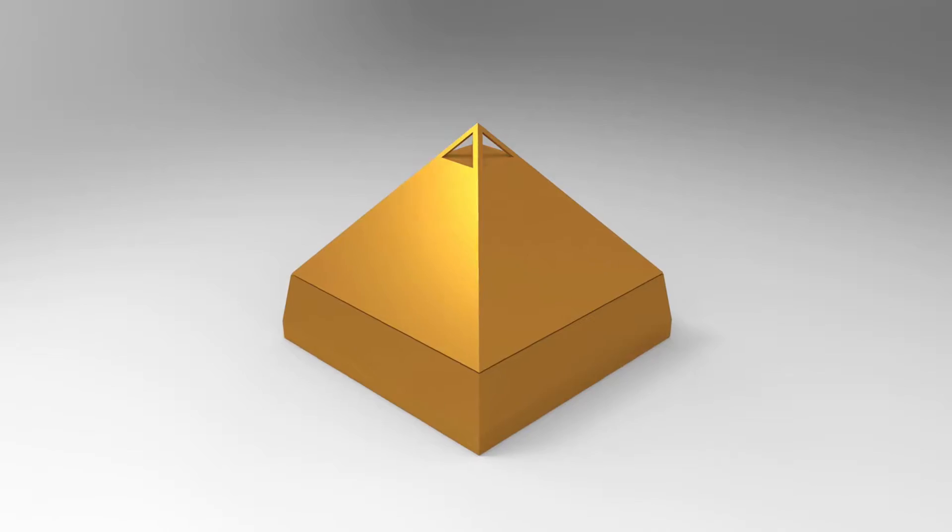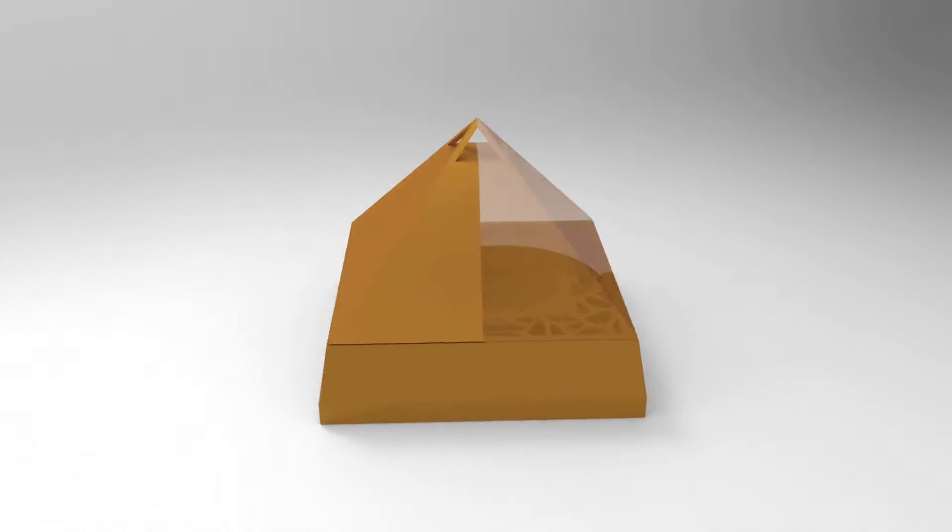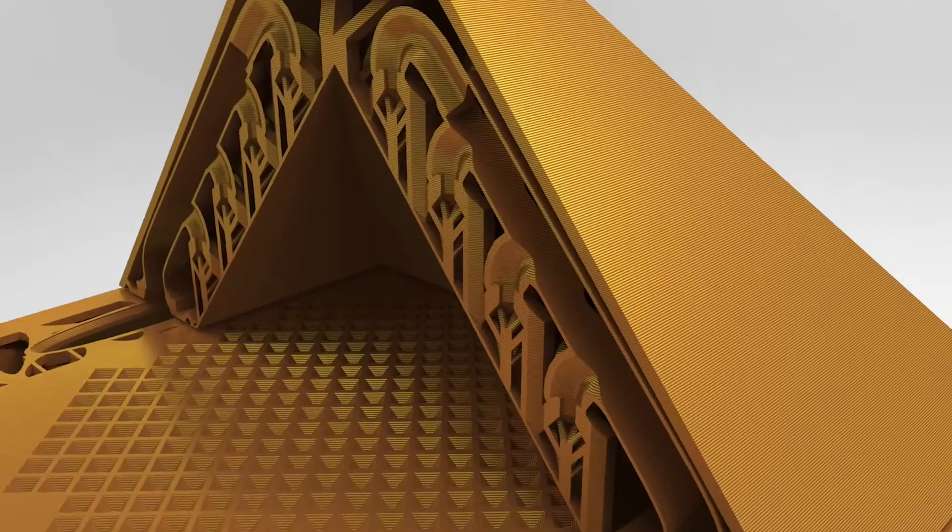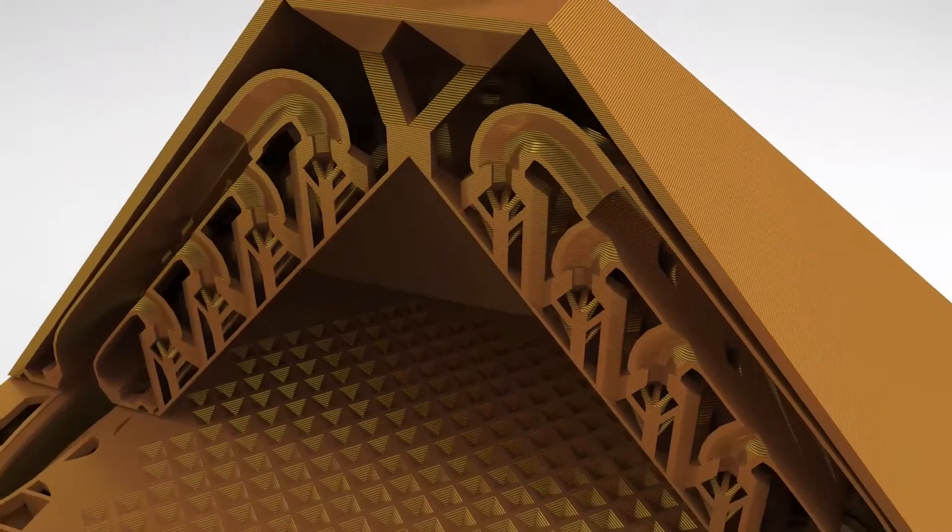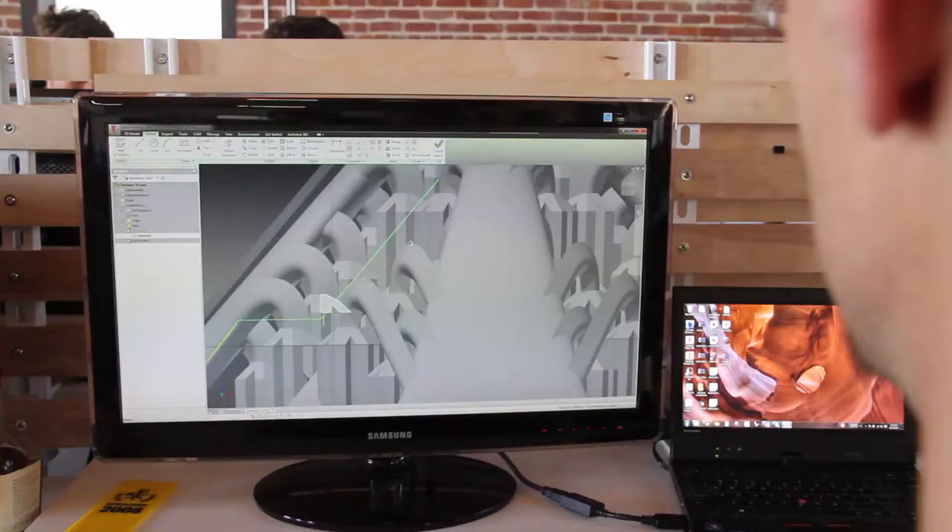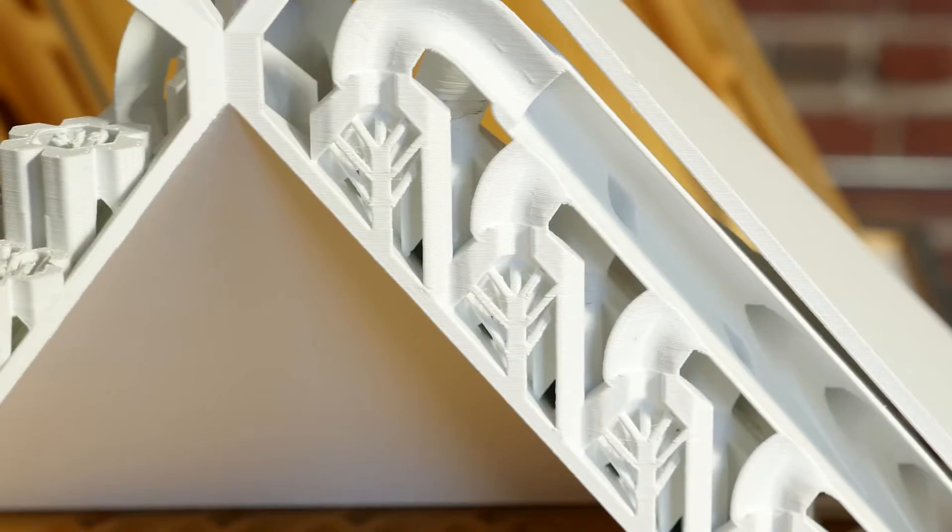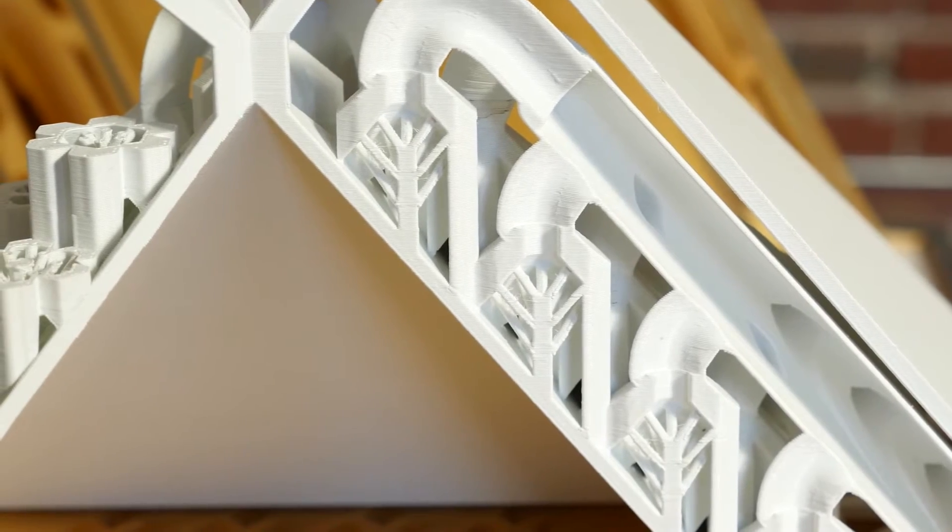You typically find metal used to build incubators and ovens because of the high thermal conductivity, and plastic is an insulator. So we had to come up with a new way of delivering the heat to the chamber walls. This combination of the generative ductwork and the heat exchangers, and then also minimizing the thickness of the wall, that's just on the geometry side.